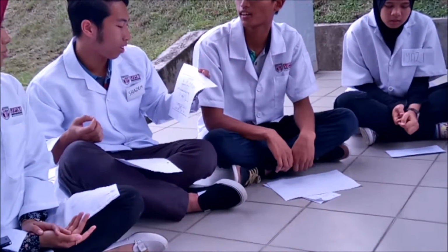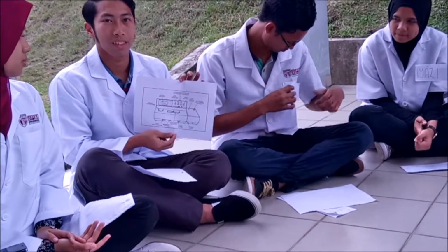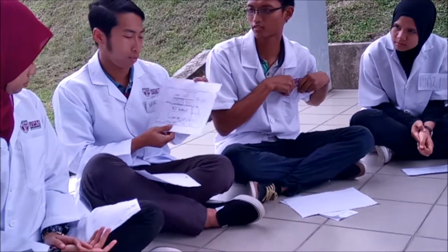We can adjust the concentration of the solution, which can affect the absorption of the solution. And the fifth one is the print button. We can print the result.